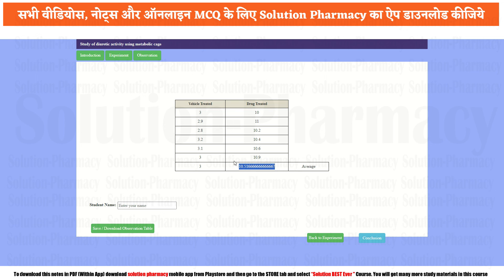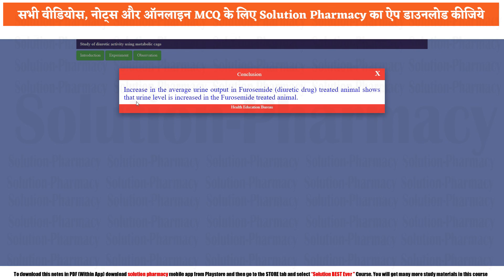Now go to the conclusion tab. The increase in average urine output in the furosemide (drug treated) group shows that urine level is significantly increased in furosemide treated animals, confirming that the given drug has diuretic activity. This was a small experiment on Xform software. Thank you so much for watching. Take care.